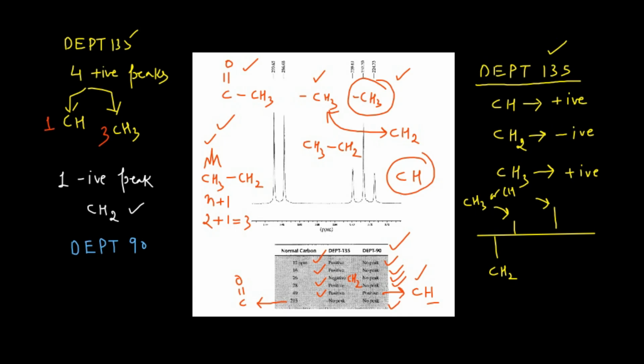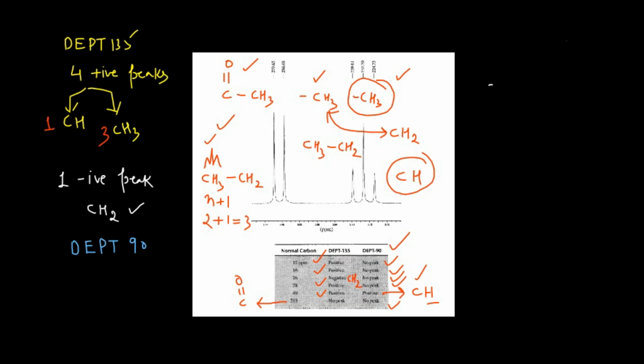Okay, so how can we connect these things? You can take the screenshot of this one. You are having this CH3, there is no problem in that, and then you are having CH2, again no problem, and then you are having this CH. Okay, along with the CH you are having this carbon double bond oxygen and then CH3. These things are here. Okay, what are you left with? You are left with this methyl group.